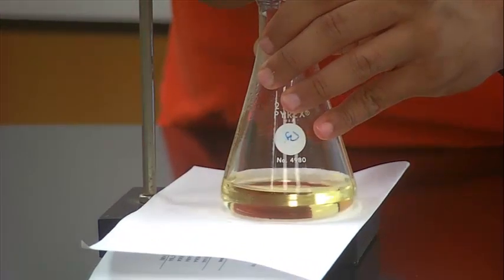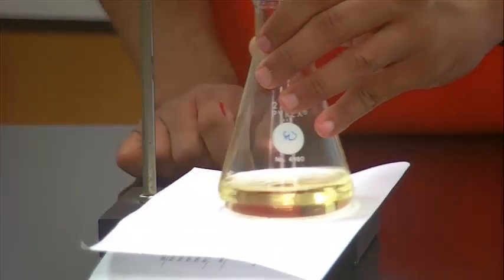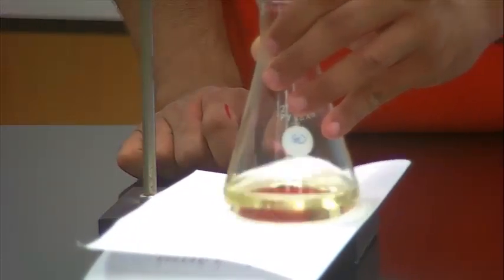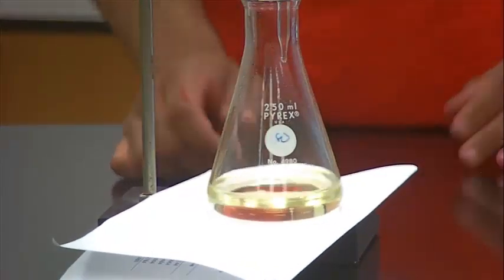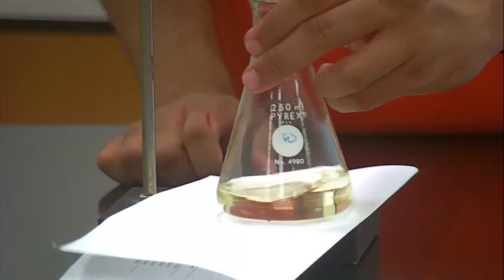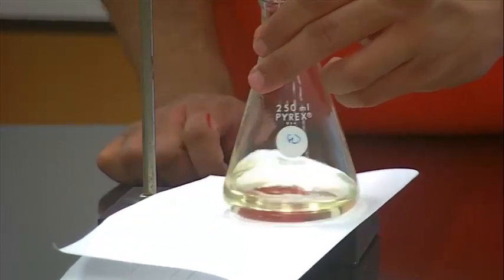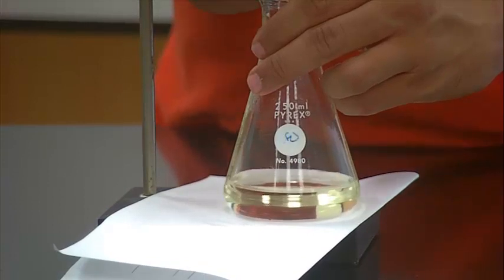And obviously the concern is overshooting. I think 1 or 2 drops should do it. Let's do 1 more.